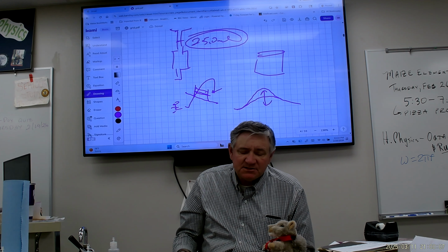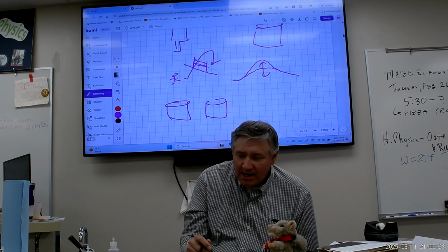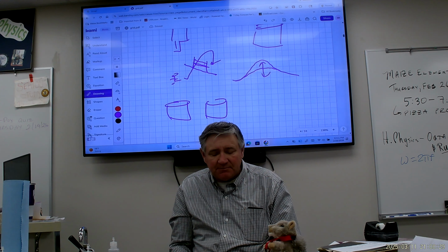So there's two things that you need to do. You take this oxalic acid, you're going to add the sulfuric acid to it, and 5 drops of the MnSO4. Then you have to get out a hot plate and heat that up. So you're going to have 2 different beakers. I would mix them both up at the same time.